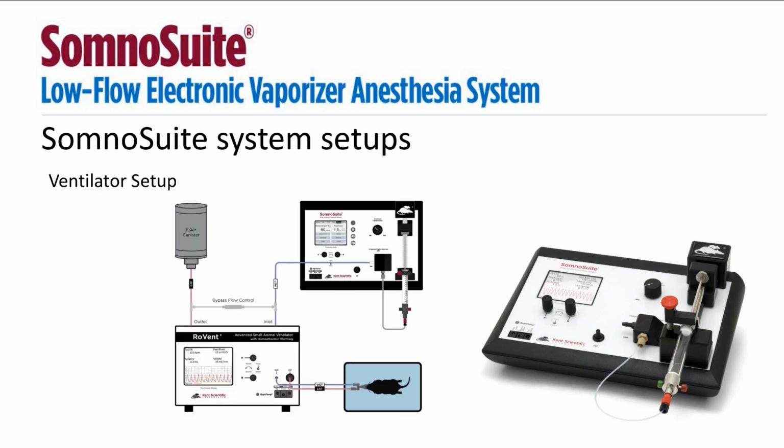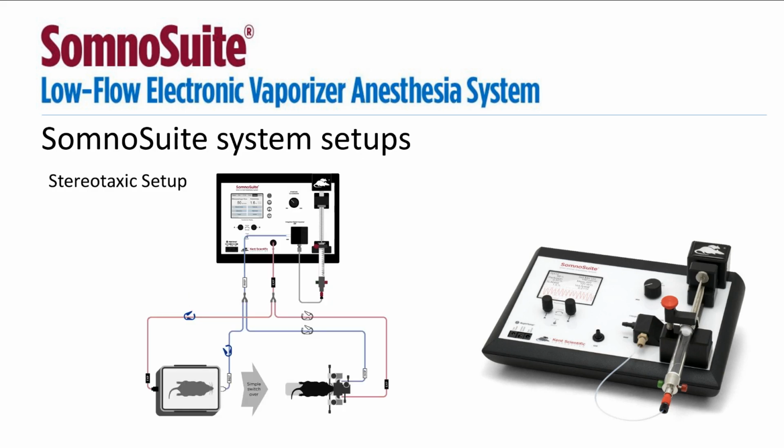For studies using a ventilator, this diagram shows how you can connect the SomnoSuite to a standalone ventilator, such as our RoVent system. If you plan on performing stereotaxic surgeries, the SomnoSuite can also interface with your stereotaxic frame, again, using the two accessory adapter.